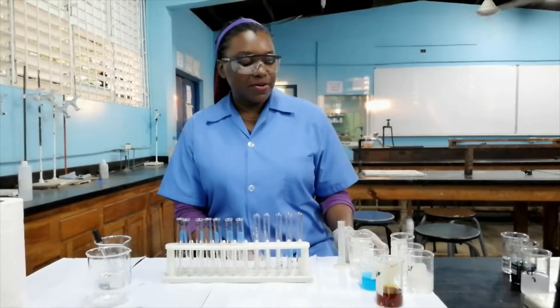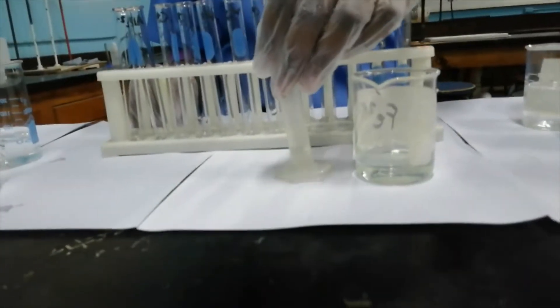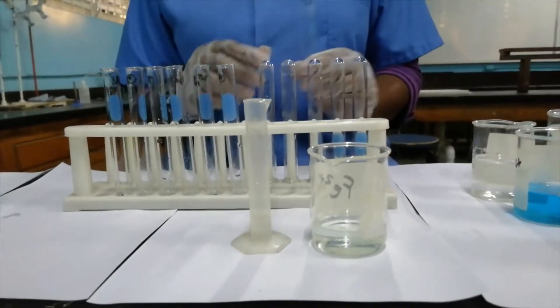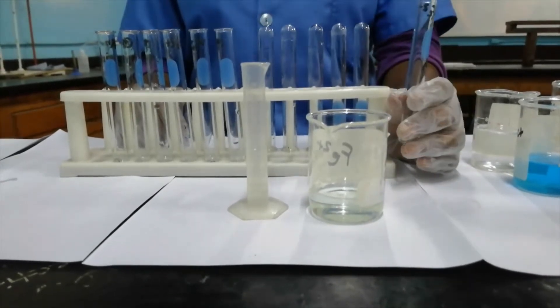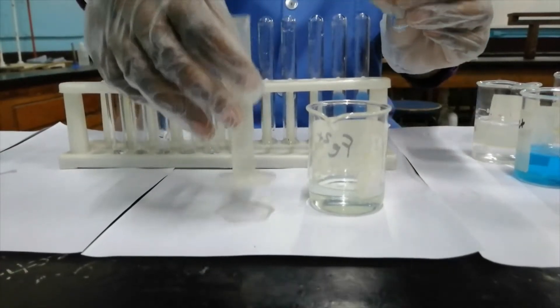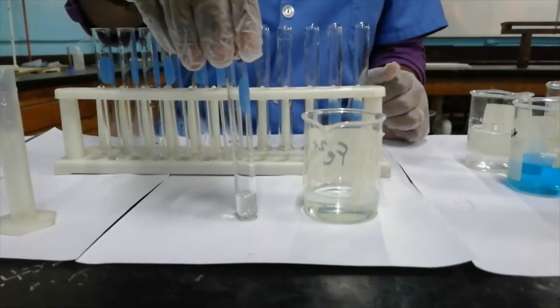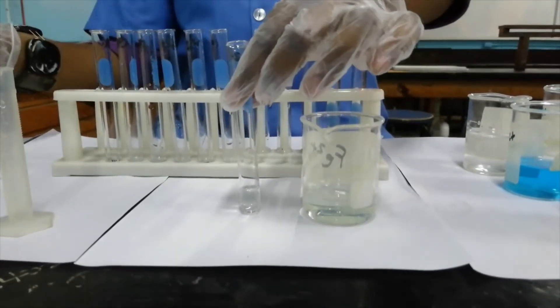The first test that we'll be doing will be with iron(II) and sodium hydroxide. Iron(II) is actually a pale green solution — that's iron(II) sulfate right there. I've gone ahead and measured out two cm³ of it so you can know what two cm³ looks like. So we have two cm³ of solution in the test tube. Remember, it's pale green.